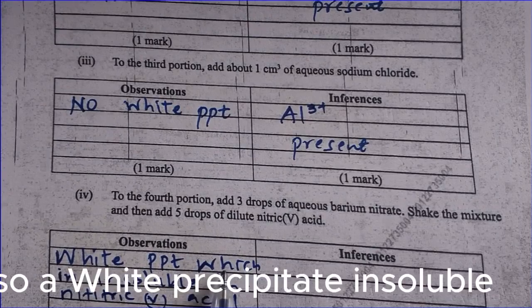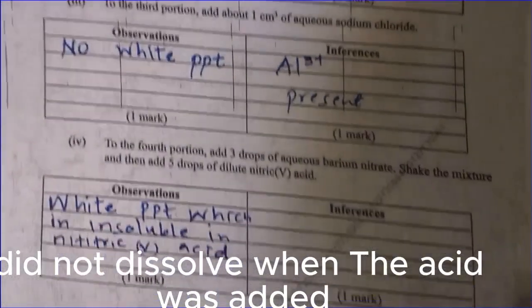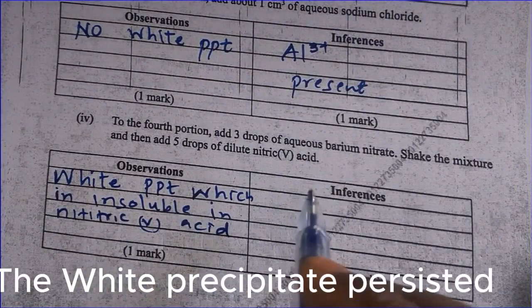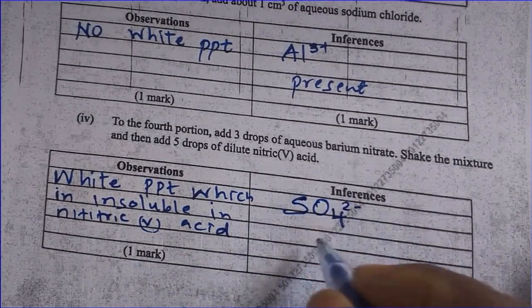So a white precipitate insoluble. It means the white precipitate did not dissolve when the acid was added. Therefore, if the white precipitate persisted, then what is present is the sulfate ions.